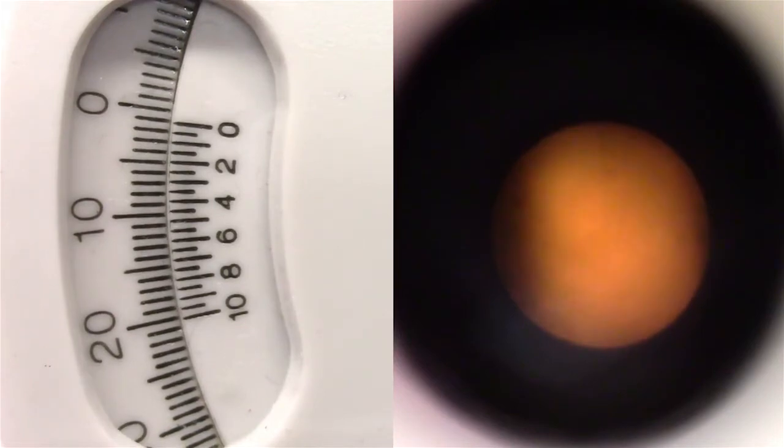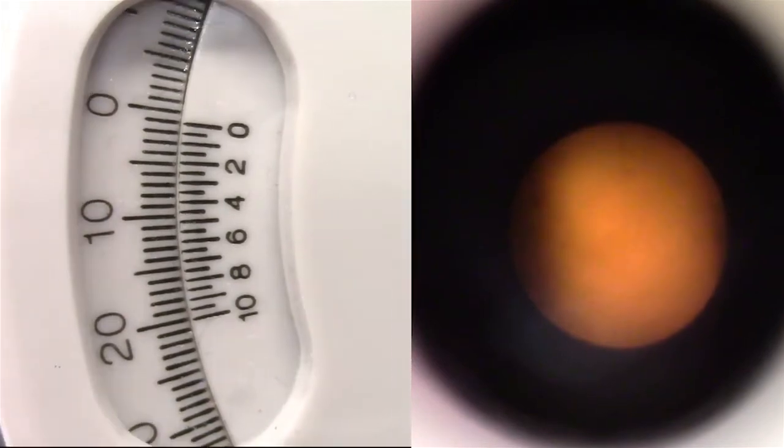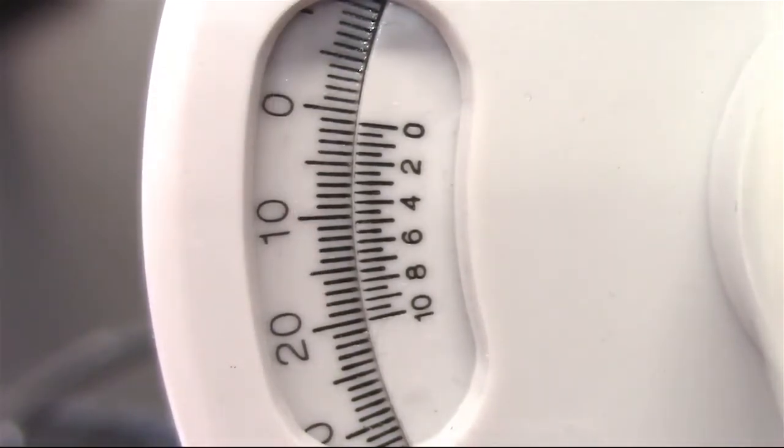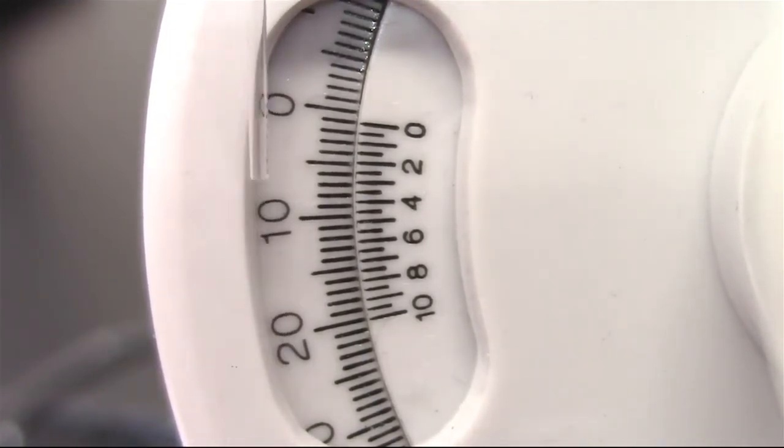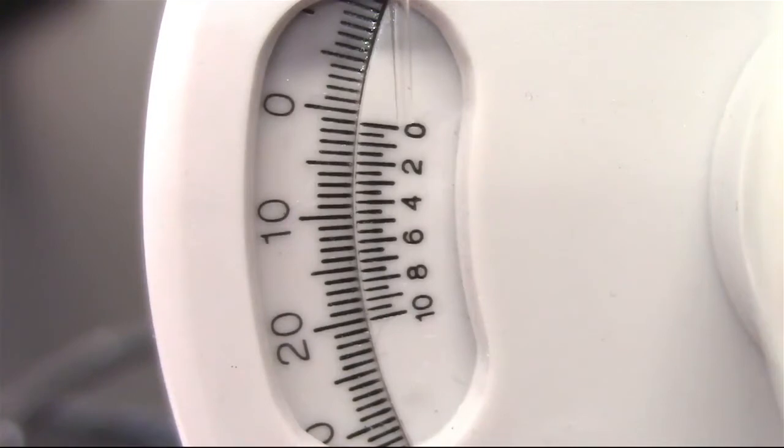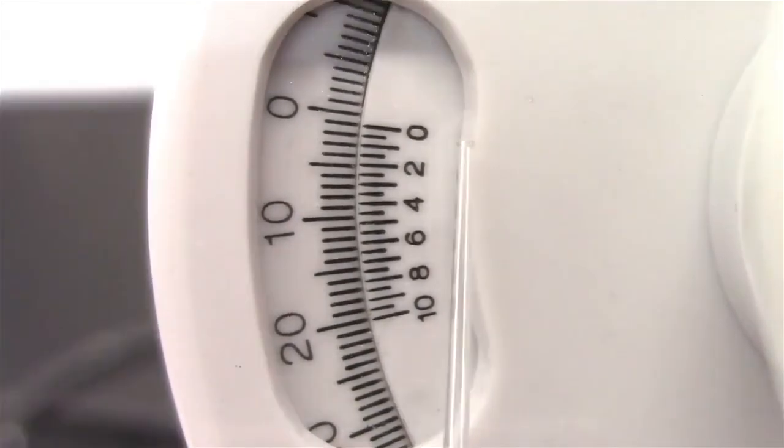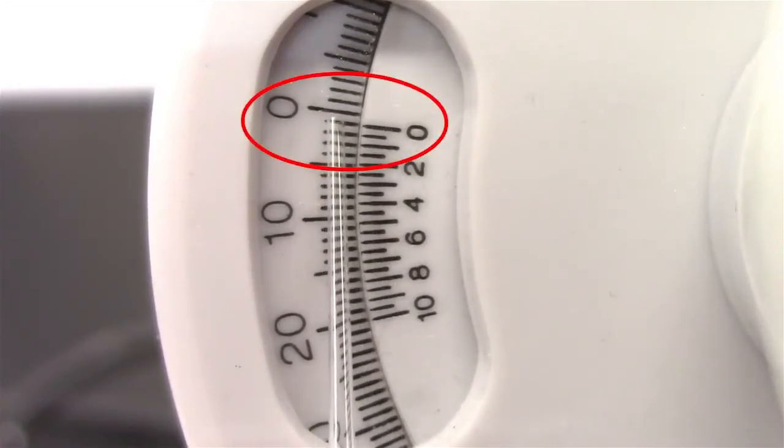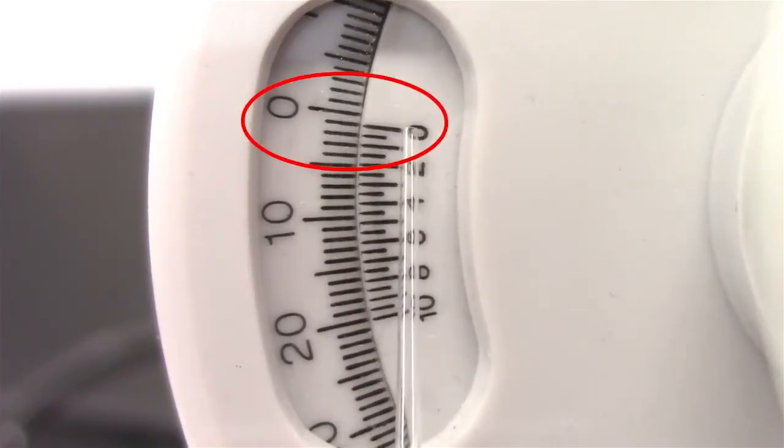Now, you can read the observed degree of rotation using the numbers on the outer dials. The outer scale is the whole number for the observed rotation reading, and the inner scale is the decimal point for the observed rotation reading. To make the reading, note where the zero on the inner scale meets up with the numbers on the outer scale.